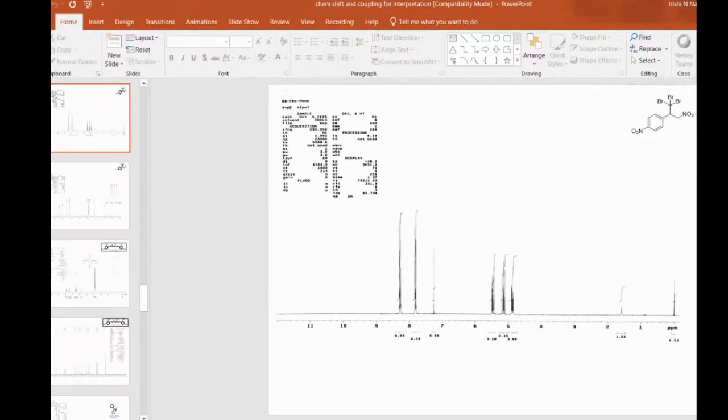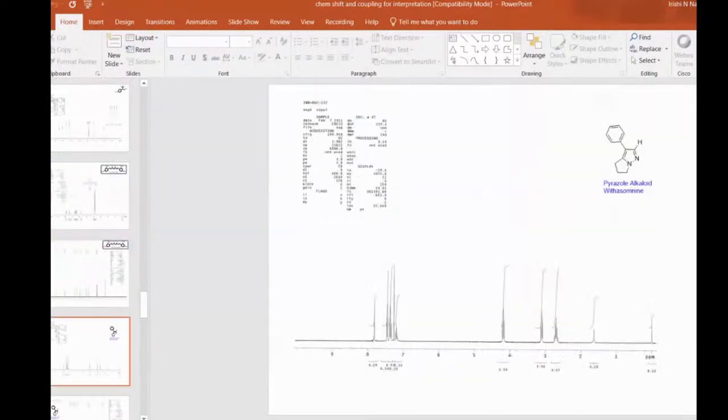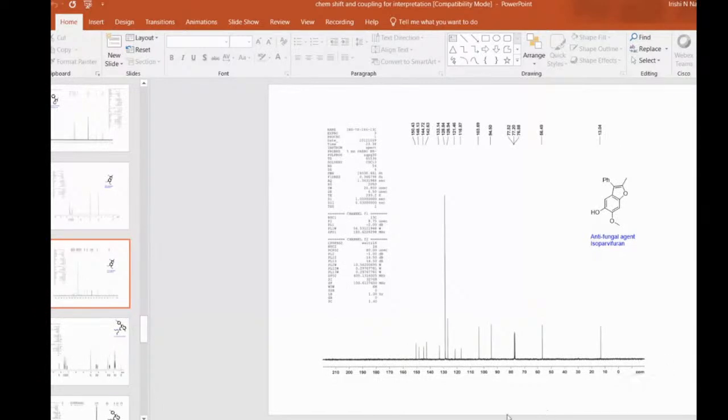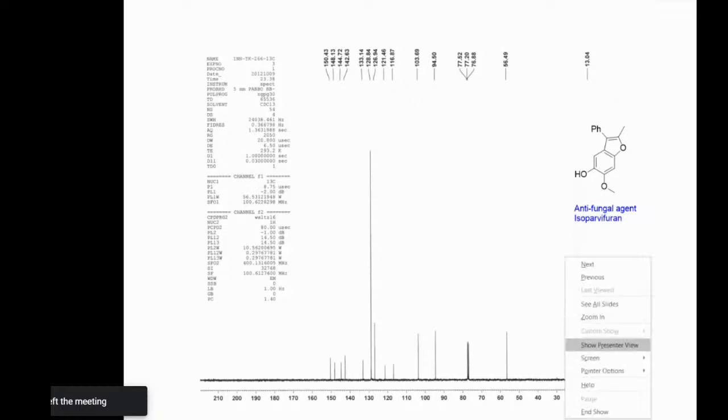There is one question from Dr. Annie Deepthi. Can you explain the 13C of the aromatic region of isoparvifuran? Okay, I think it is. Okay. Now, the aromatic region has six. How many?